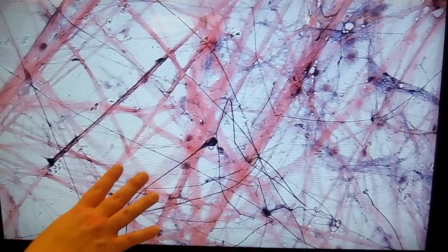And remember, the cells are the only living portion of the connective tissue. The remainder of the tissue is made up of extracellular matrix.